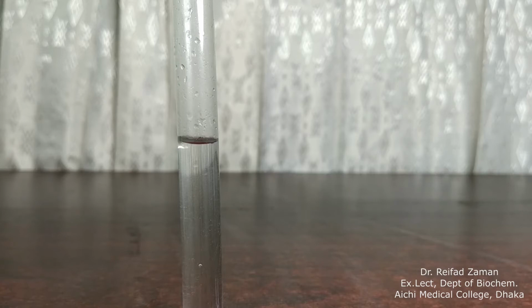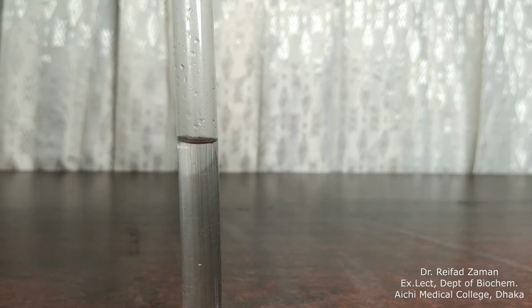Colloid তোমার বাসার মধ্যেই আছে, তুমি হয়তো প্রত্যেক দিনে এটা খাও। সেটা কি? Milk. Yes, milk is a colloid. So next time কেউ যদি তোমাকে example জিজ্ঞেস করে example of colloid, please একবার হলো do say milk, because this is one of the most common colloid that a first year student has encountered. So let's add some milk to it.